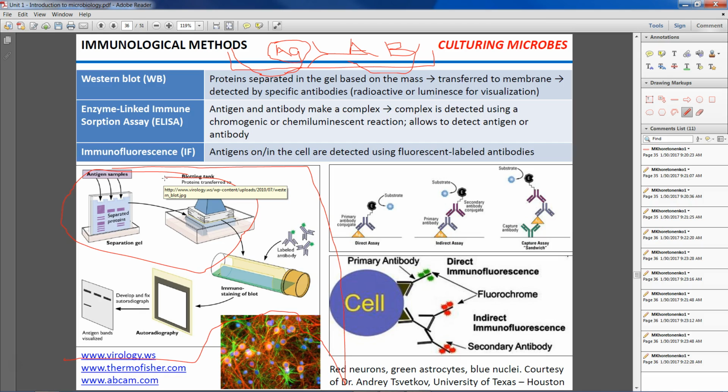And these proteins are going to have different weight. Do you agree with me? So what you do next, you put those proteins on so-called gel. It really is a gel. And you apply electrical current to them. So they start moving through the gel. Not me. They start moving through the gel. That makes sense? They follow the electrical current.